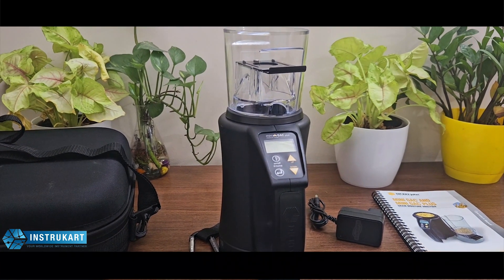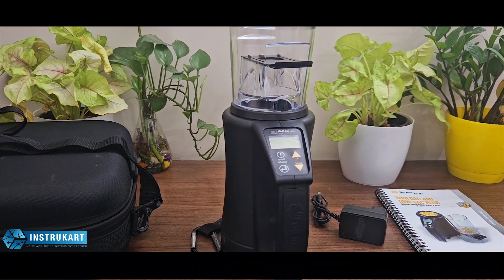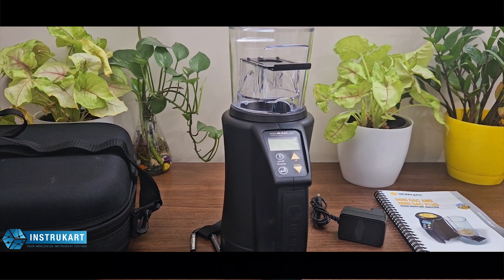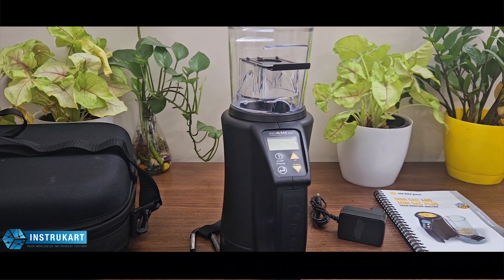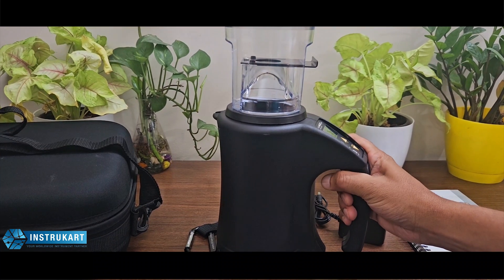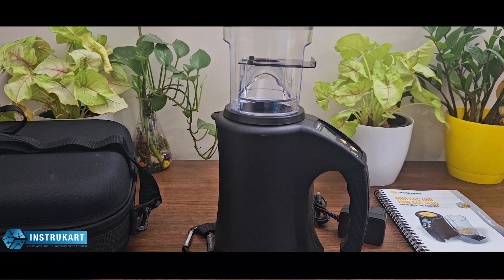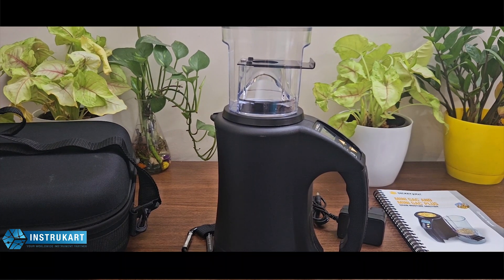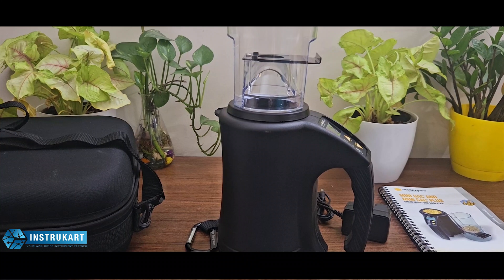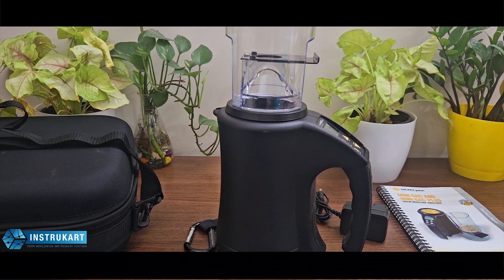It tests hot or cold grain between 32 to 122 degrees Fahrenheit and has automatic temperature compensation. The device includes accuracy of 0.5 degrees Celsius or 1 degree Fahrenheit.